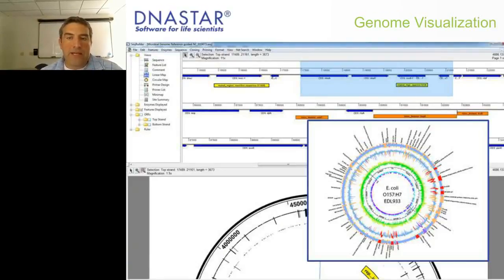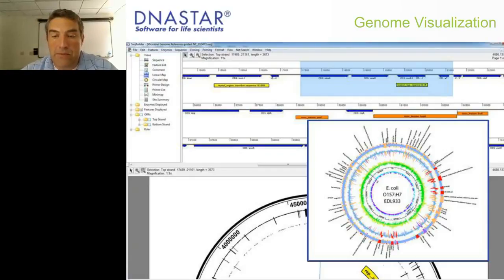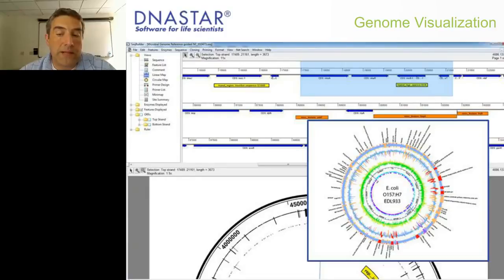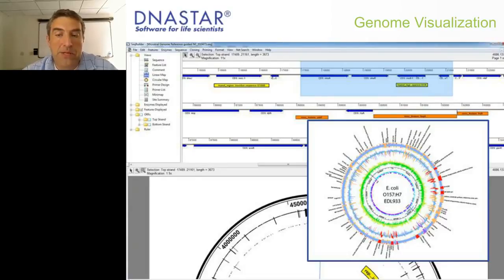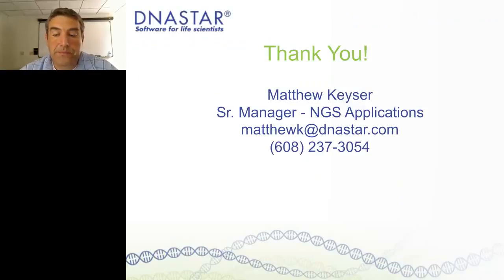Once I've done the annotation, I can move on to genome visualization. There are multiple different ways I can look at genomes in DNA Star software. We have the SeqBuilder maps, which give me linear and circular maps. We also have our GenVision software that can produce publication-quality figures really nice for microbial genome mappings — information tracks all to scale brought together from different areas of the DNA Star software to make a really nice-looking map.